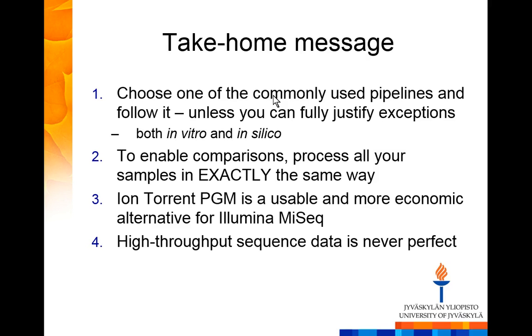I will also hopefully be able to convince you that Ion Torrent PGM is a usable and definitely more economic alternative to MiSeq sequencing.